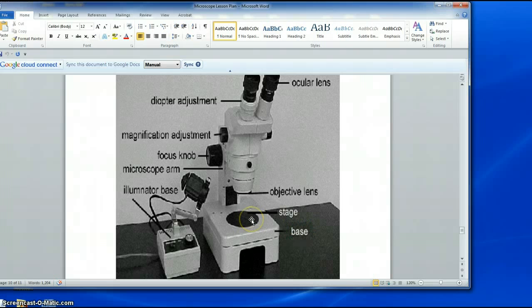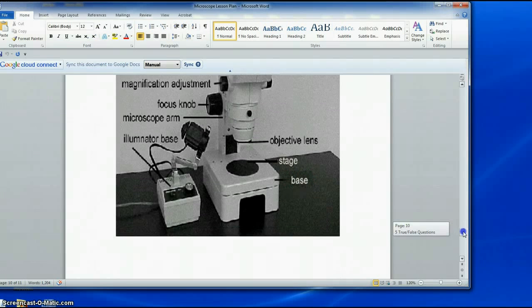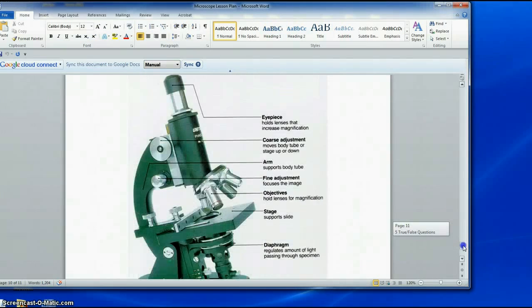Sometimes you can get a better view of the specimen by looking at it from the top lit view by shining a more intense light on it and by turning the bottom light off. It's something you can try and see how it works. Sometimes it's a better thing, sometimes not.